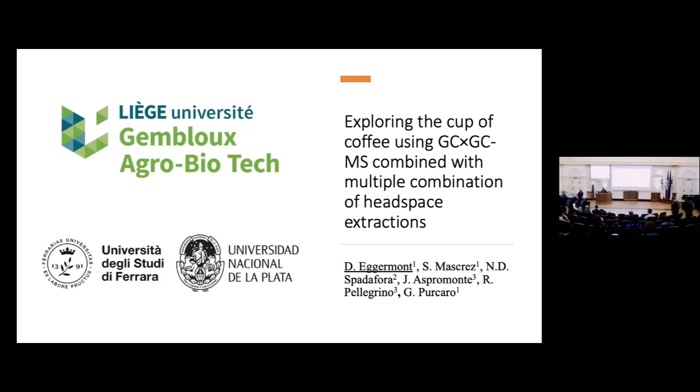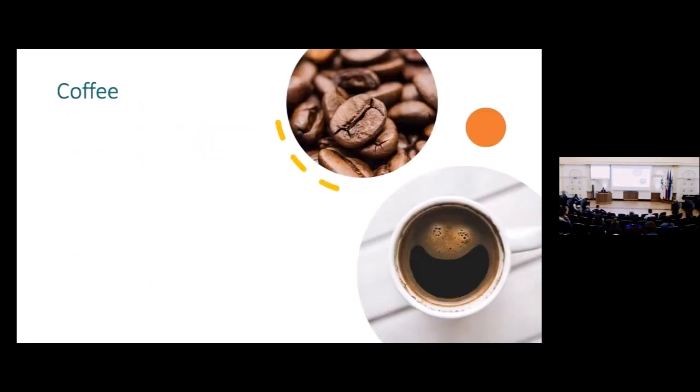Today I will talk with you about the exploration of coffee brew aroma volatile profile using GC×GC-MS, combined with multiple combination of headspace extraction. But first of all, let's talk a bit about coffee.